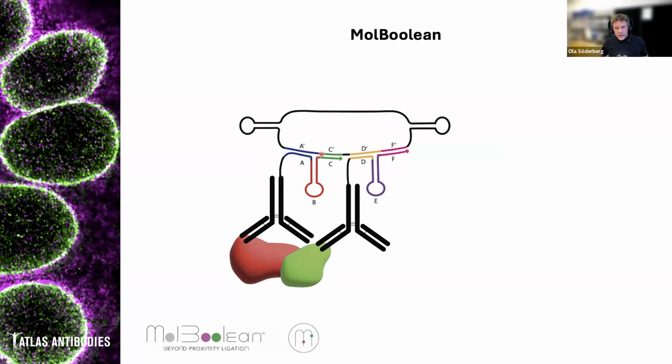The oligos were designed so that they contain the site for a nickase. So this oligonucleotide sequence here will be the recognition site for a nickase, which is a restriction enzyme that only cuts one of the strands. And this structure you see here is the loop.